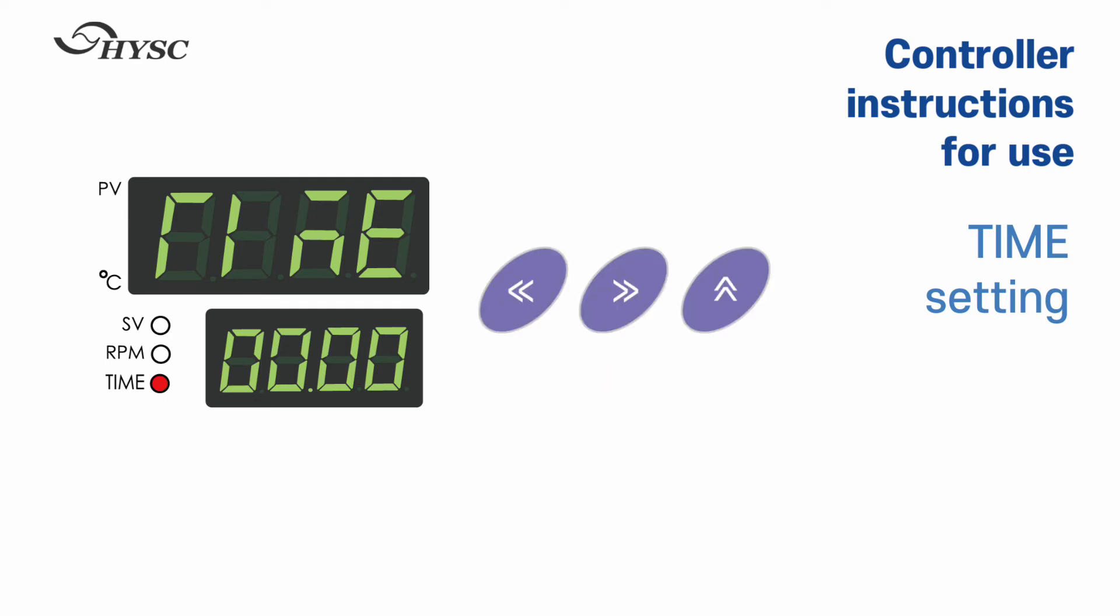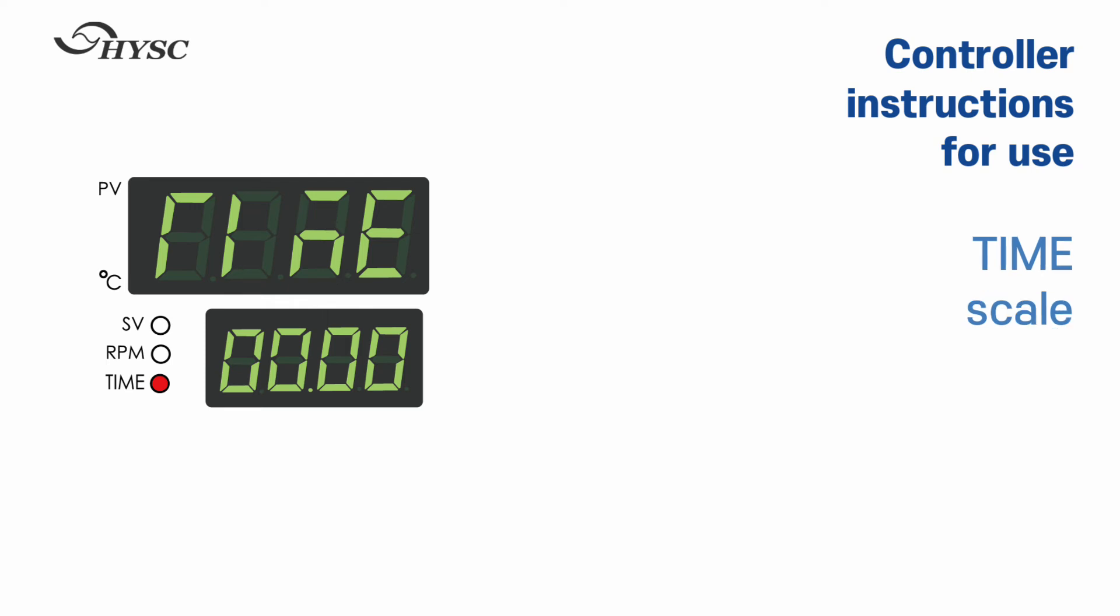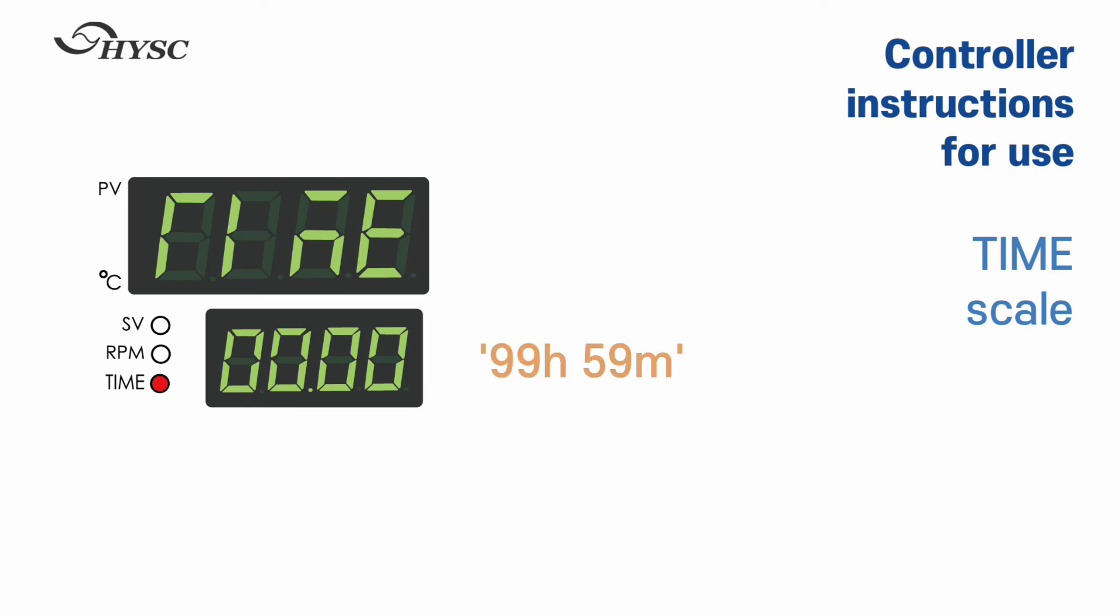Set the time using the digit shift keys. The default unit of time is hours and minutes. The maximum time to set up is 99 hours 59 minutes.